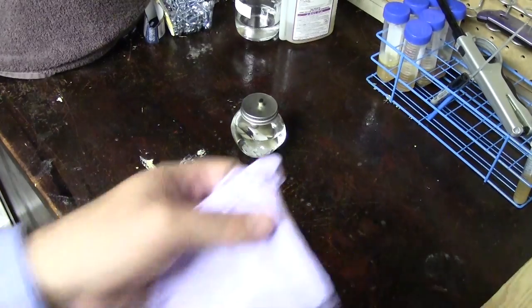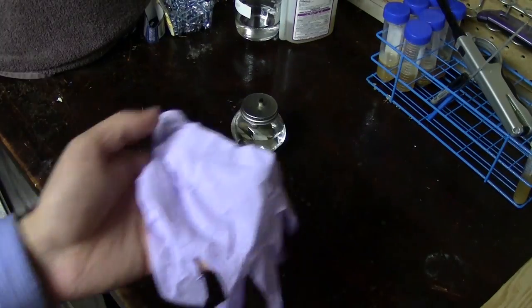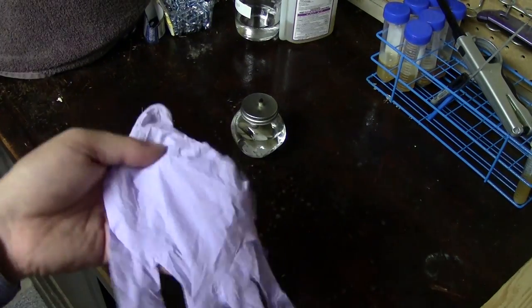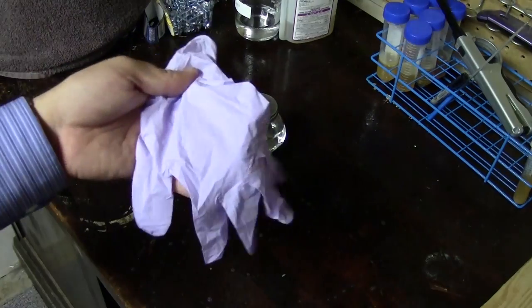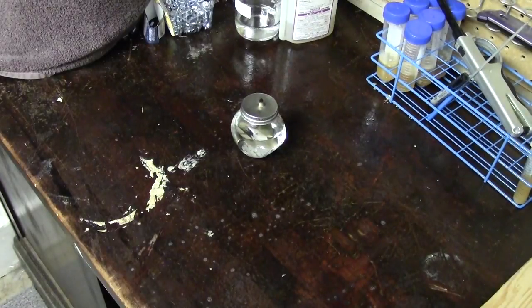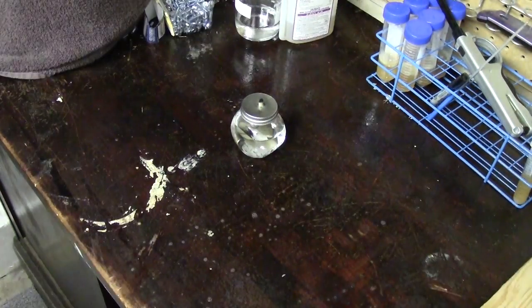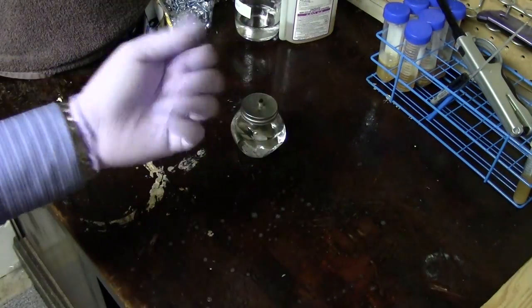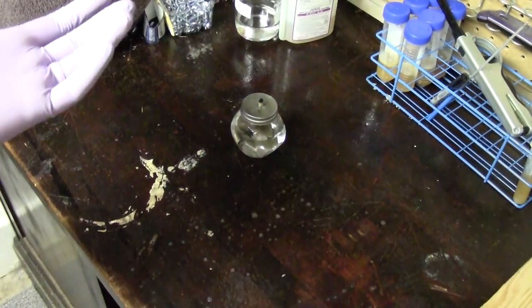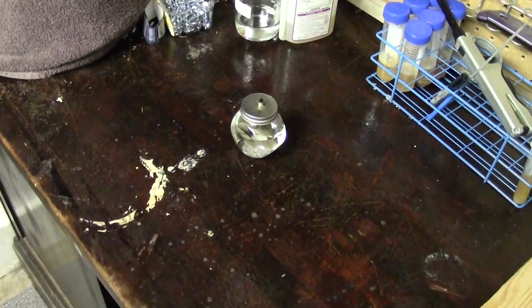The topic of gloves is maybe a little more controversial. In biology labs we wear these to protect ourselves — they're not actually to protect our samples, they're to protect us from our samples. Since we're growing beer organisms in our home lab, we don't really need protective steps like this, though they do cover your skin and might add a bit of a protective barrier. What I find is that gloves really impair your dexterity, and the loss of dexterity is worse than the risk of not wearing them — but it's up to you. Just make sure if you do buy them, you're wearing something tight-fitting.